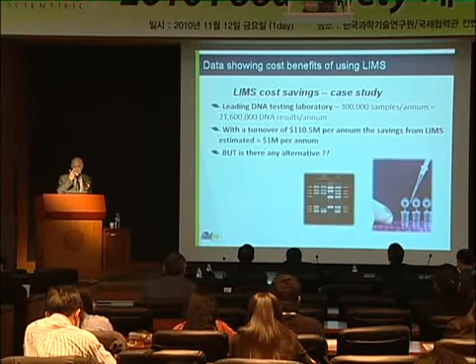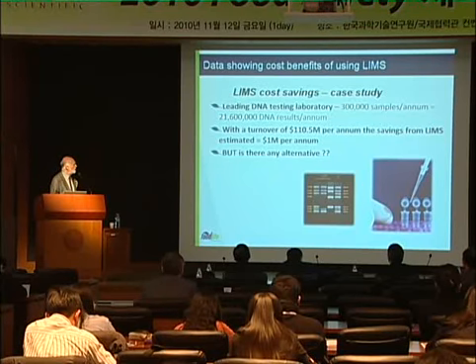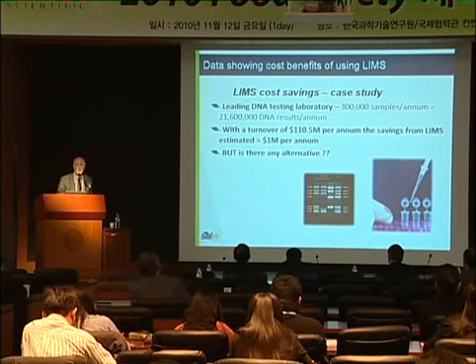This is an example of a laboratory. It's not a food testing lab, but it could easily be. It's a lab doing DNA testing. Typically 300,000 samples each year are analysed, generating over 21 million individual DNA results.